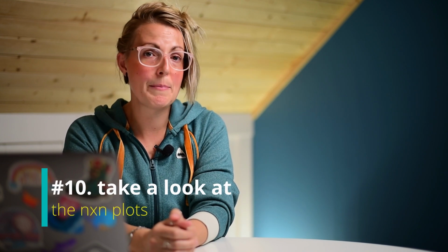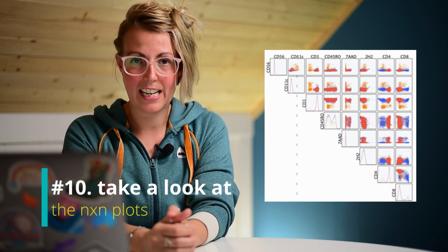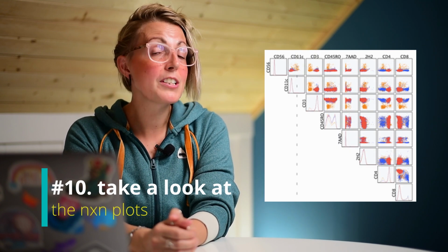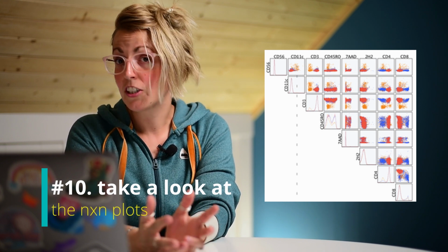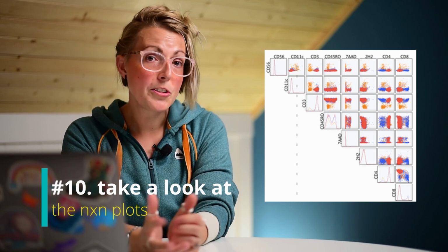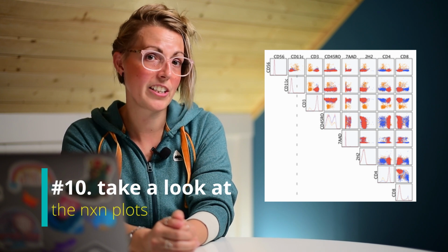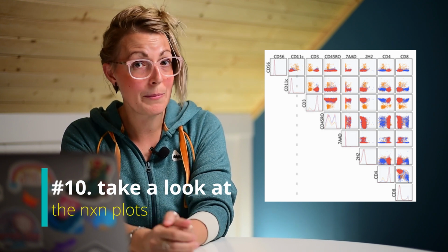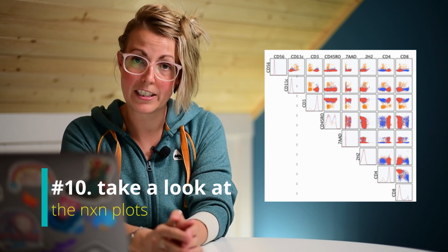And last but not least, always look at your n by n plots, or a multigraph display of every marker displayed against every other marker. We talked about this previously in the compensation video, and this also applies here. So yes, you can still use it to look for compensation errors. You can also use it to look for interesting populations that you may not have considered in your gating structure, and may actually find something interesting. So those n by n plots are critical in every experiment.